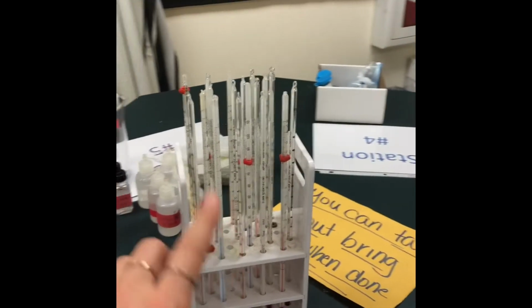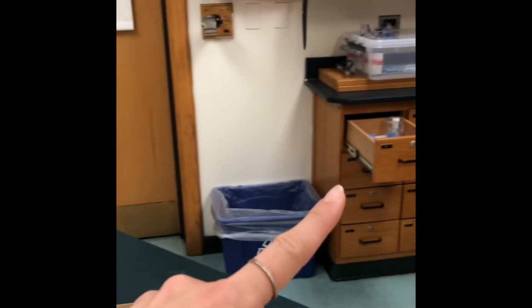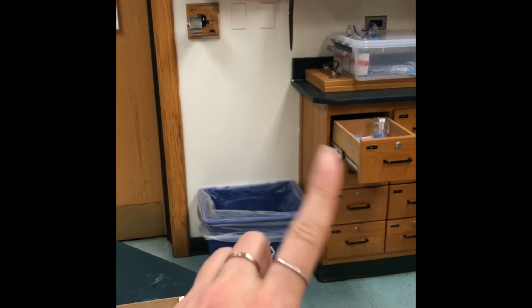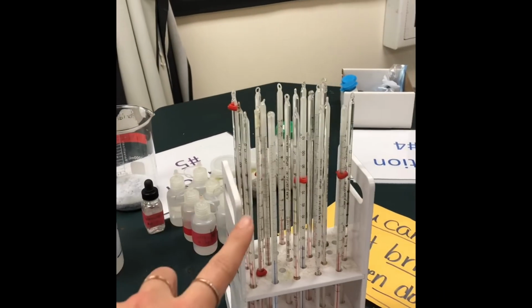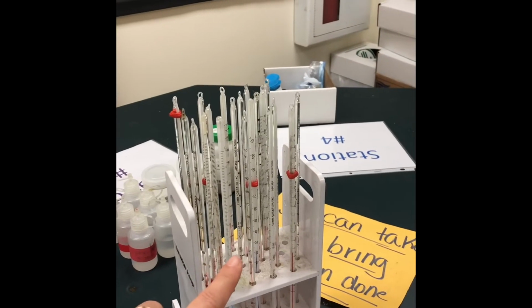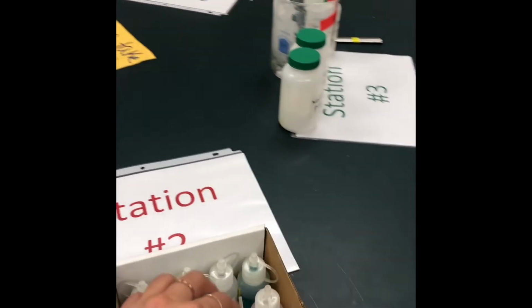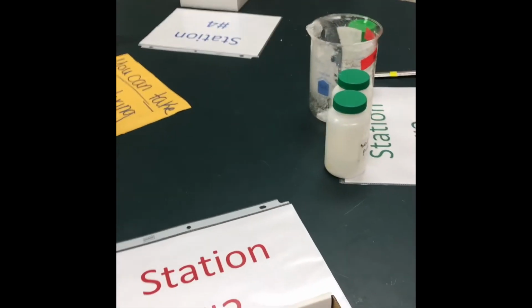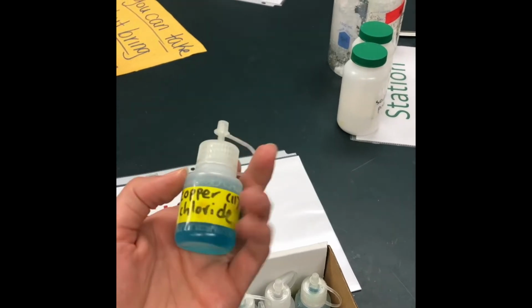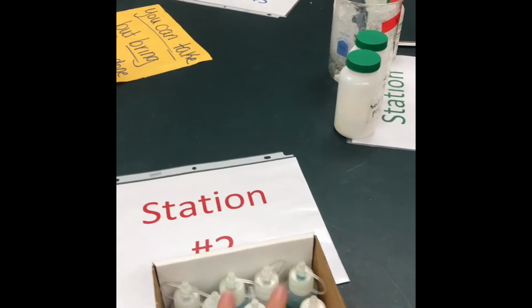Lastly, for station 1, you're going to need a thermometer. We don't have enough thermometers for you to keep in your personal drawer, so don't put it in your personal drawer. Instead, return it back here. But before you do so, please rinse it off and clean it with a scrub brush and some soap. Okay. Moving on, station 2 is pretty self-explanatory. Station 2 is going to require you to take the chemicals you need. Remember to always read the containers and take exactly what you're asked for. Don't just assume and start picking up everything.